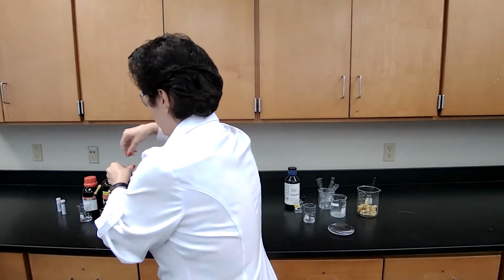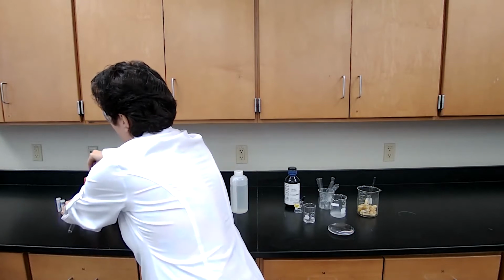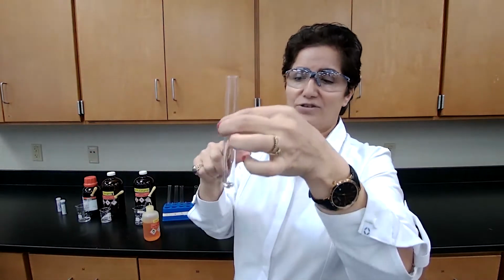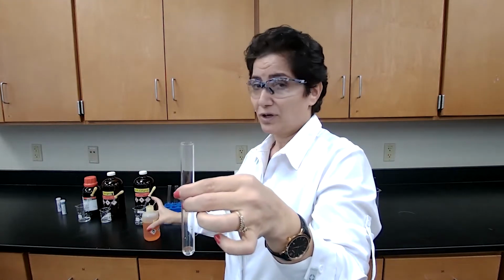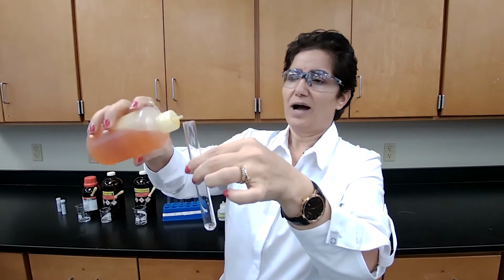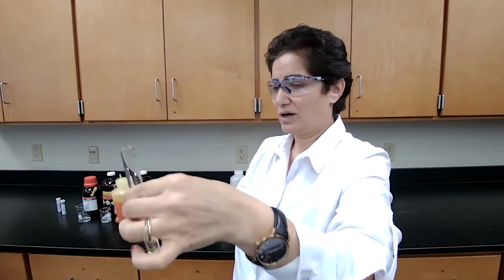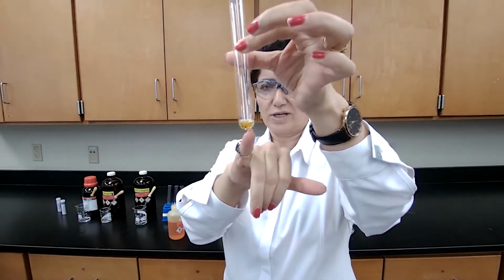The last compound that I want to test is pentene. Pentene, ENE, is an unsaturated hydrocarbon, but at the same time, it doesn't have the alcohol functional group. So it's not expected to give that dark red color with the ceric nitrate, which it's not.